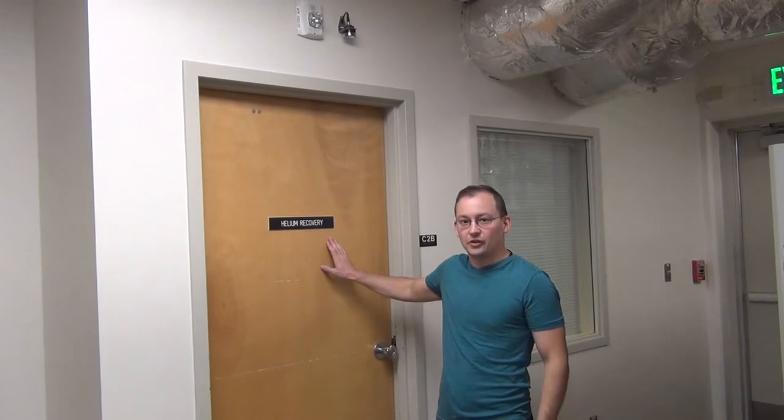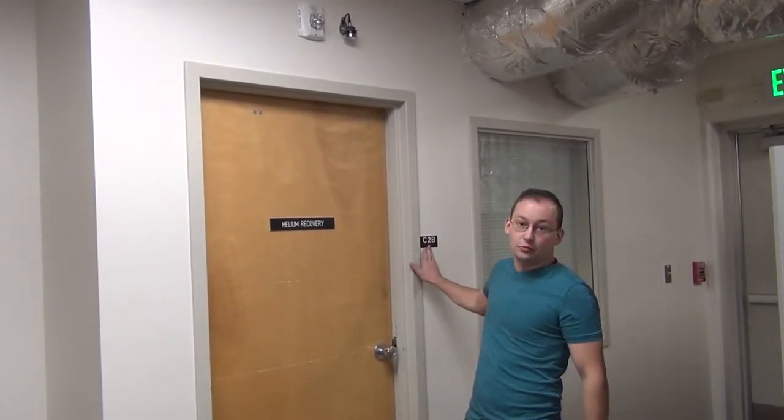Hi guys, I'm Daniel Bates. I'm here at Colorado State University. I work in the Materials and Molecular Analysis Laboratory. I'm the cryogen guy, and today I want to show you how we're doing a helium fill of a Dewar. We're here at C2B down in the chemistry basement.